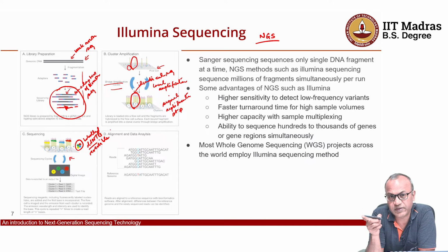In the previous cases, when we were doing automated Sanger sequencing or the manual method, the ddNTPs were not reversible, they were permanent ddNTPs. In this case, using chemistry, we can actually obscure the 3' hydroxyl group, or we can remove the chemical to expose the 3' hydroxyl group.